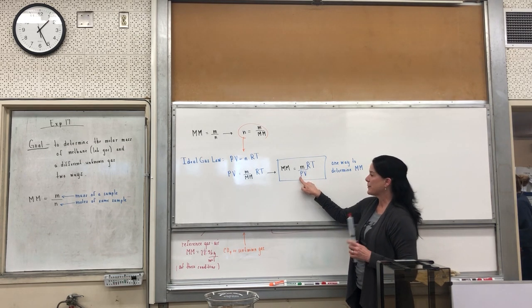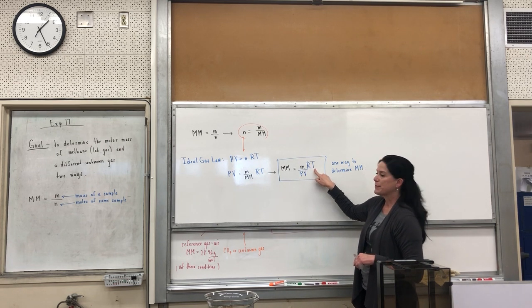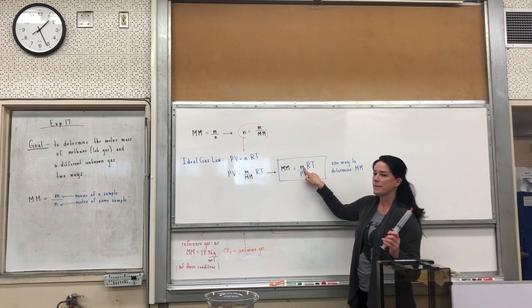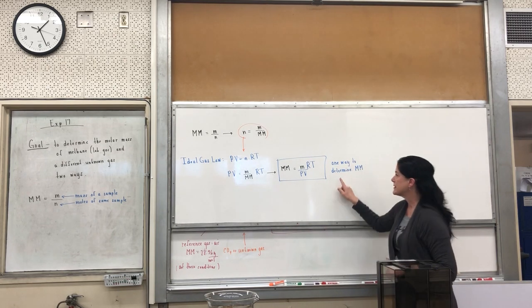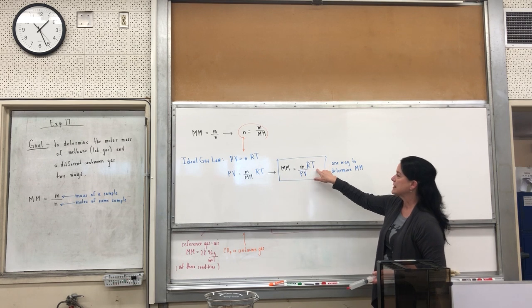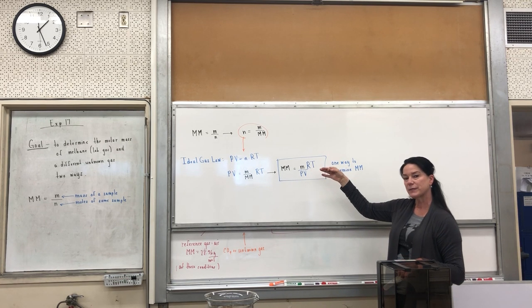So that's the volume. The pressure is going to be whatever the barometric pressure is today, which we'll get off the barometer or from weather.com. The temperature is the ambient temperature in the room. And then the mass we're going to measure on a balance. I'll talk more about that in a minute because measuring the mass is a little bit tricky. Okay, that is one way to determine the molar mass. It works as long as you know the pressure, volume, mass, and temperature of a sample at a given moment. But that's 4 measurements, and every time we make a measurement, there is some error inherent in that measurement.